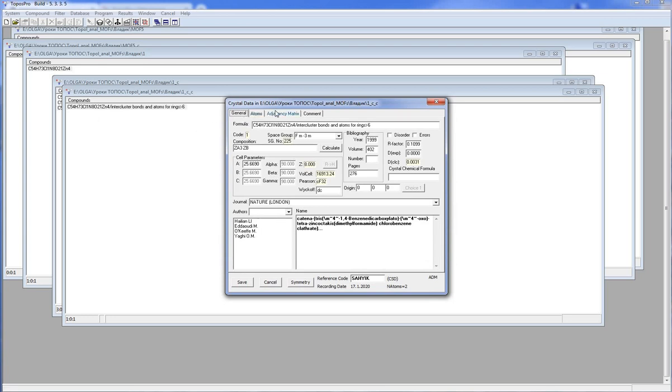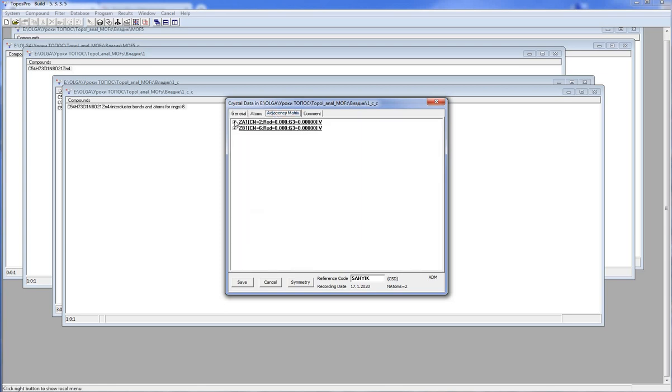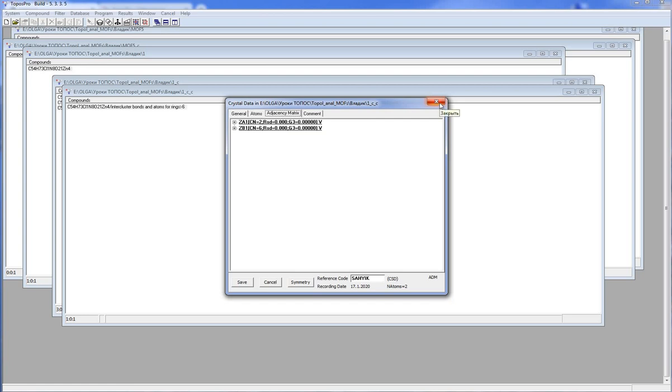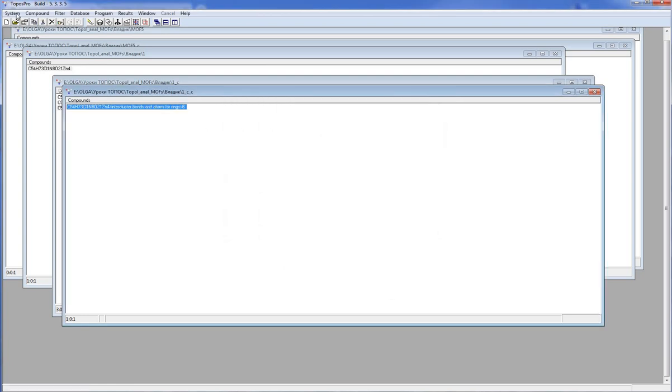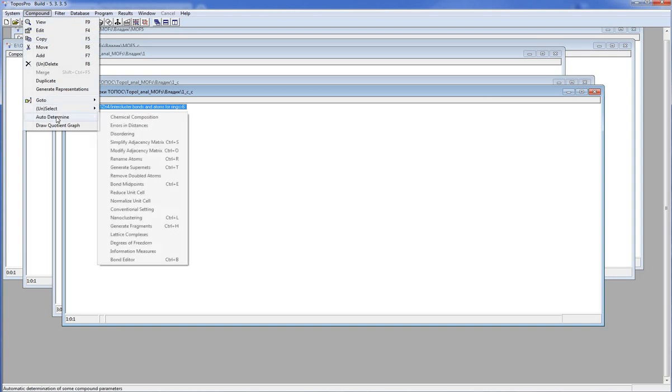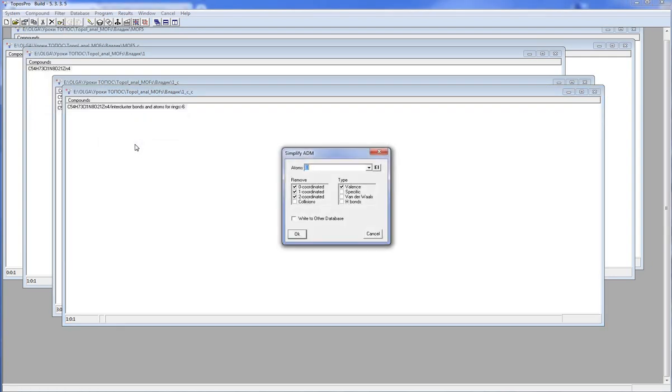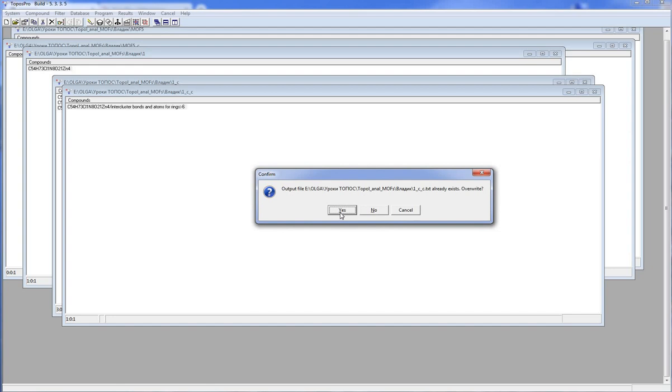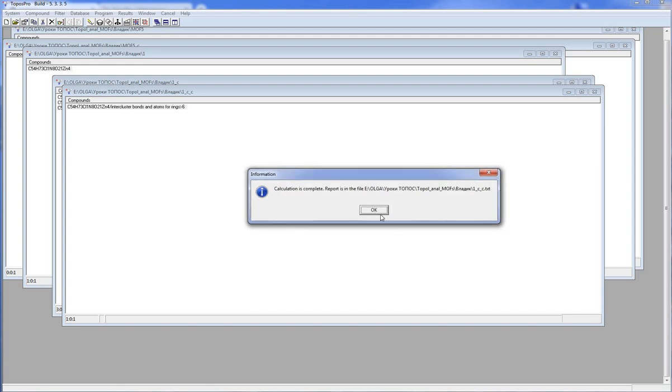We have simplified the structure. There are two coordinated nodes here, so before classification I have to transform them into the net edges. I open Compound, auto-determine, simplified adjacency metrics, remove all 0, 1 and 2 coordinated nodes. Now I can classify the structure.